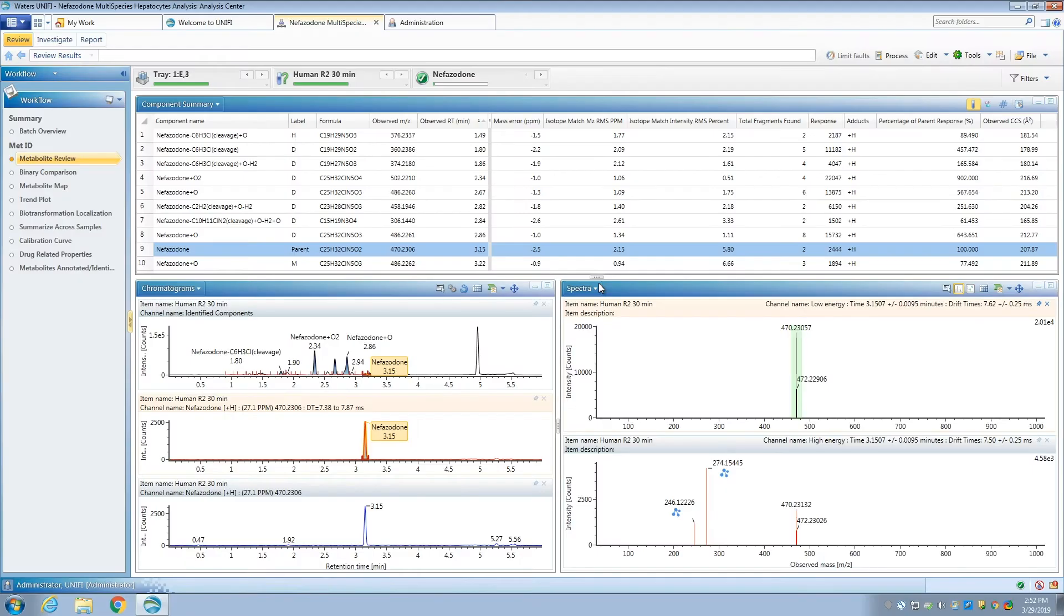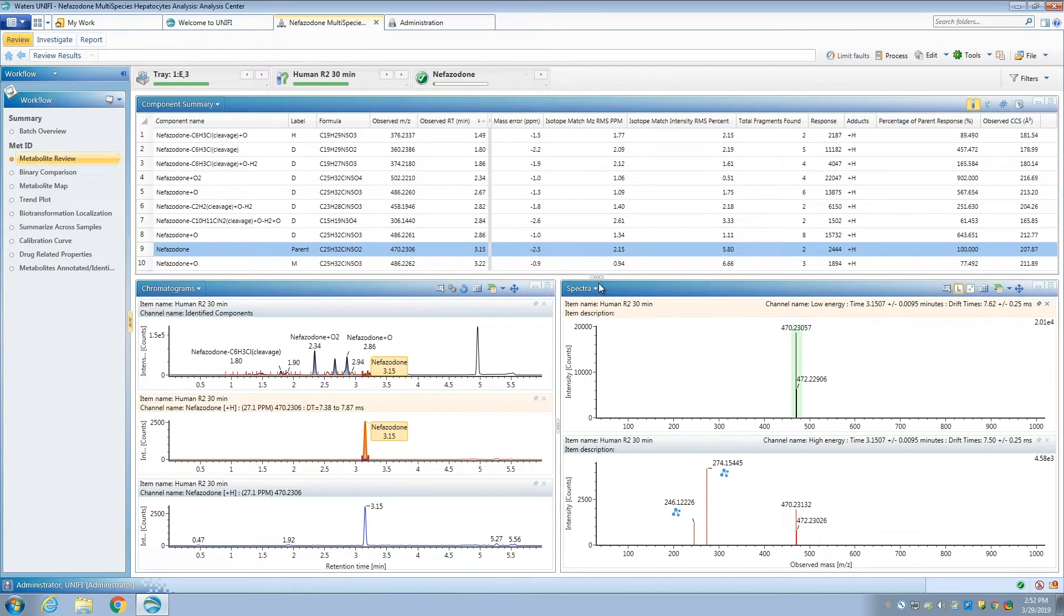Now I'm going to introduce to you the UniFi application solution for metabolite identification. A consistent workflow is essential to review your data. This is the default MetID workflow that helps users navigate through qual-quan datasets with application-specific steps. The identified metabolites workflow step is the core of the software and has all of the relevant information at your fingertips.